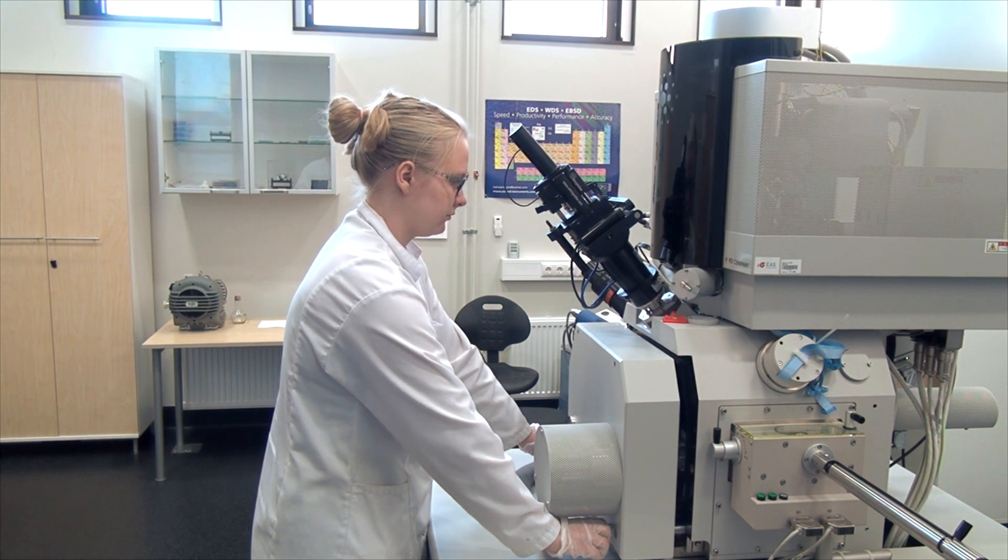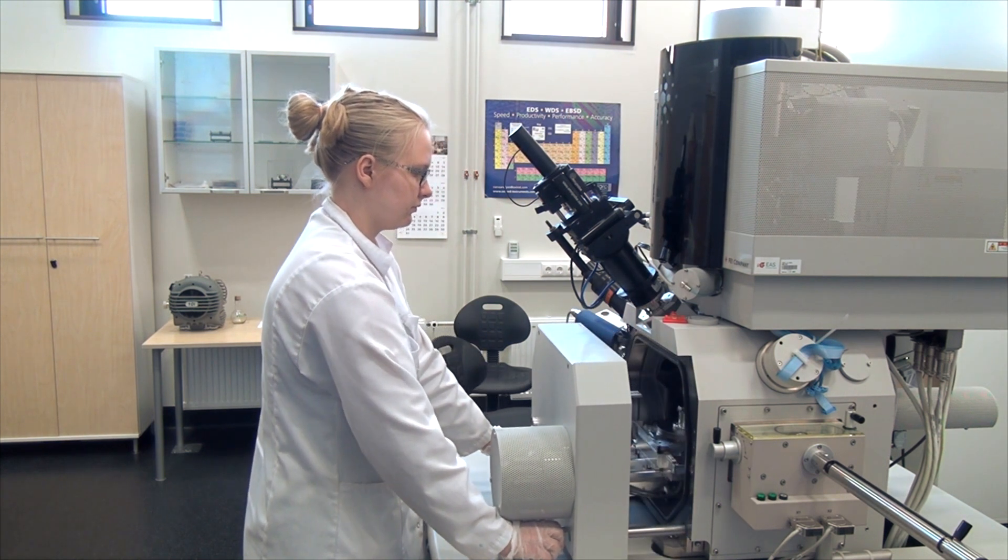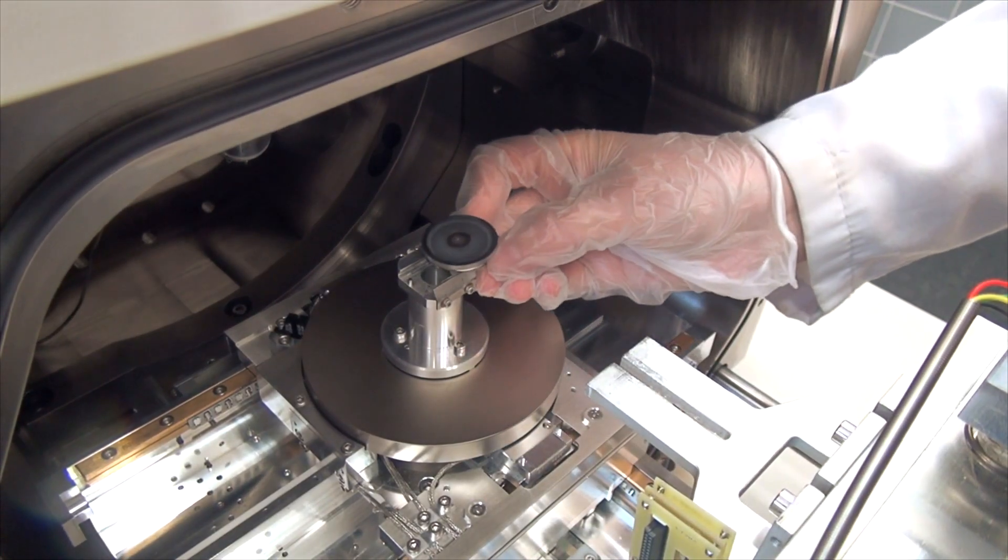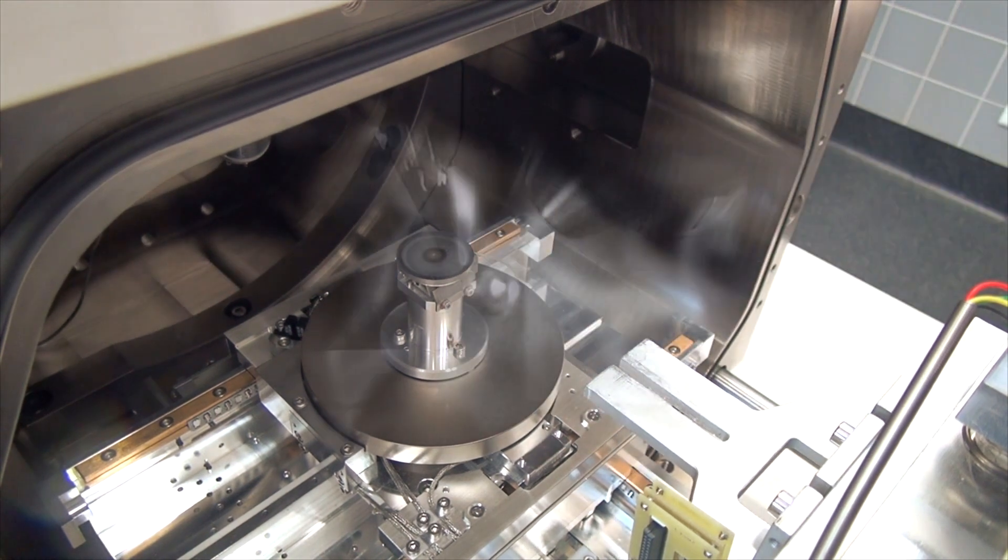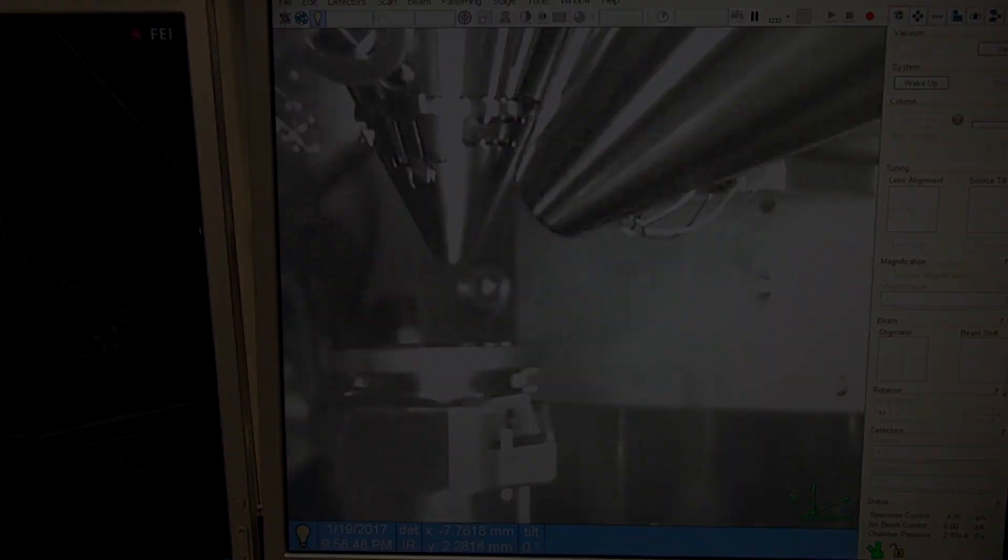Our current sample is too big to be inserted into the microscope through the airlock, and therefore, we will use the main door instead. Now that the level of vacuum is sufficiently high in the chamber, we can start our studies.